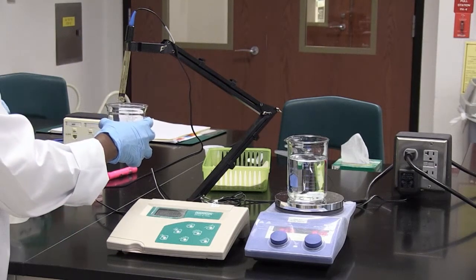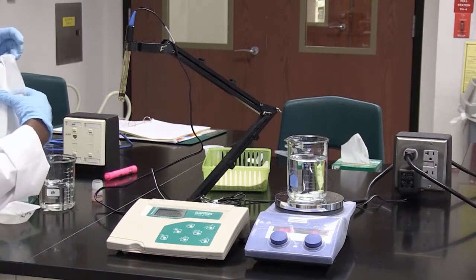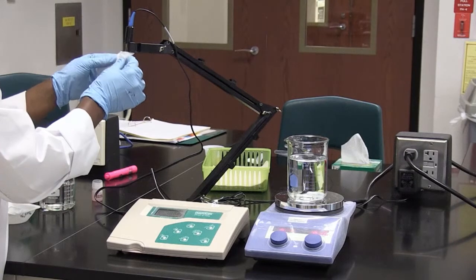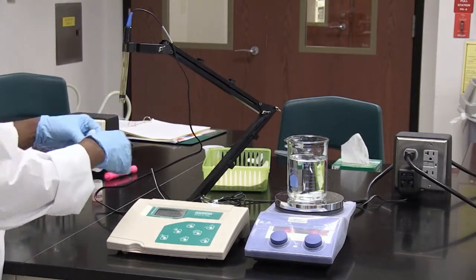Then I'm going to use Kim wipes to gently wipe the electrode — just on the outside of it. Don't go into the electrode to wipe it. Just wipe on the outside.